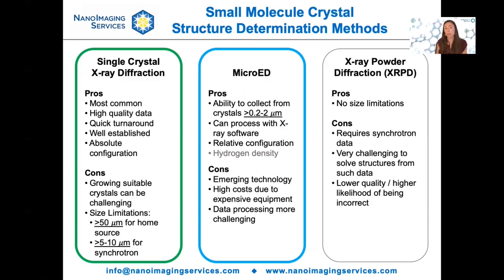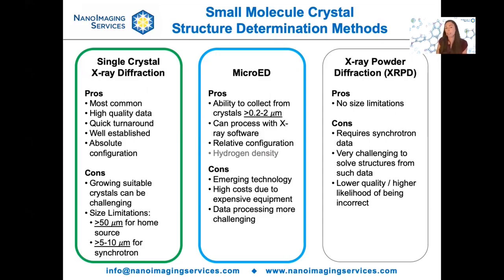Micro-ED is a wonderful alternative to single crystal x-ray diffraction when crystals are too small for x-ray collection. Micro-ED can work with crystals in the 0.2 to 2 micron range, making it a nice complementary technique for capturing those that fail single crystal x-ray diffraction. X-ray powder diffraction is another method without a crystal size limitation, but it typically requires synchrotron data for high enough quality structure solution, data processing is incredibly challenging, and there's a much higher likelihood of getting an incorrect solution. In my mind, micro-ED is poised to really replace x-ray powder diffraction as a method for determining structures when crystals are too small for single crystal x-ray diffraction.